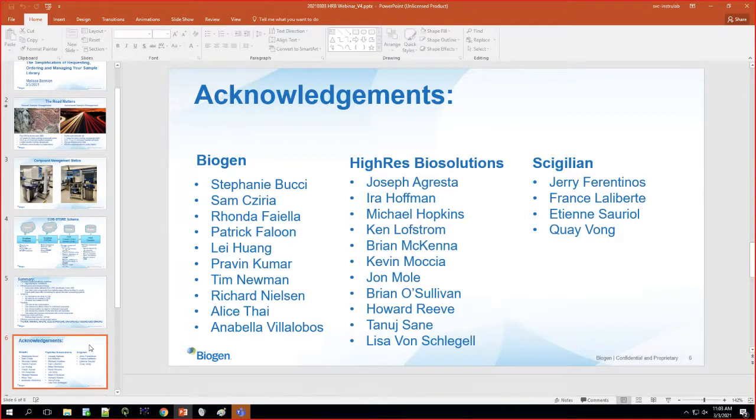So first question: is Sigillion an internal inventory software? Do you want to give a description of the Sigillion software? Yes, so that is our internal inventory of compounds. The software has two pieces, as I said. Request is a place where you can go in and type in or enter a list of samples, and you can see the inventory: how much of each sample is available, at what location, in which plates, etc. And Sigillion Store is where the samples are located electronically. That's the database of our samples.